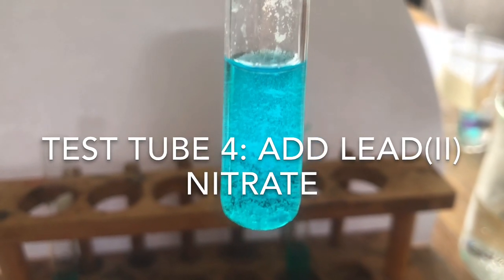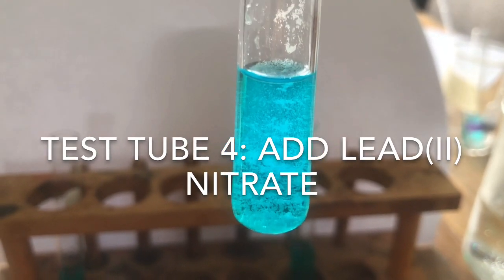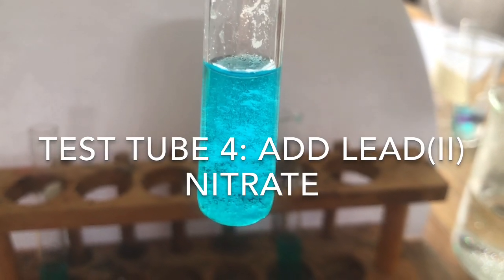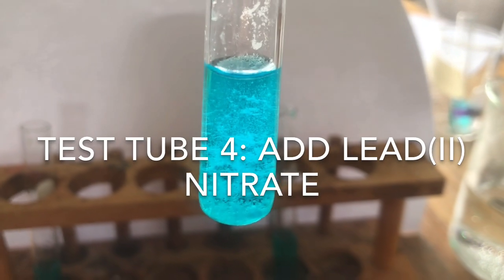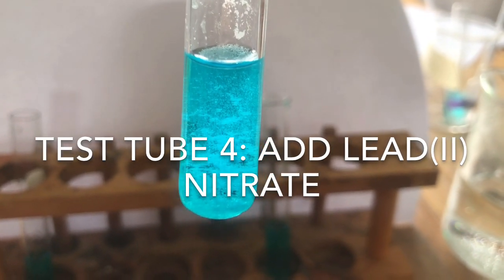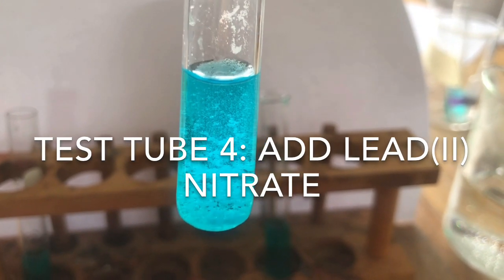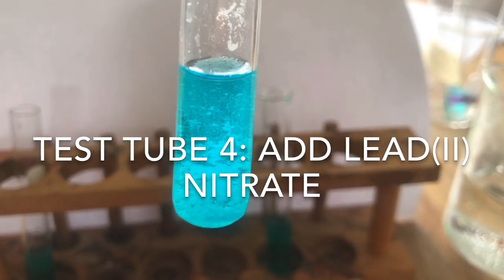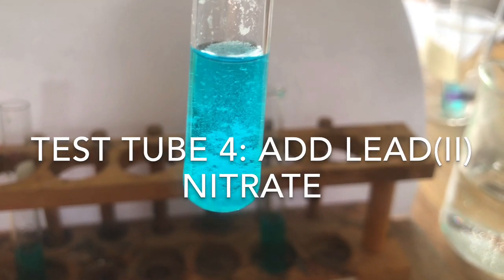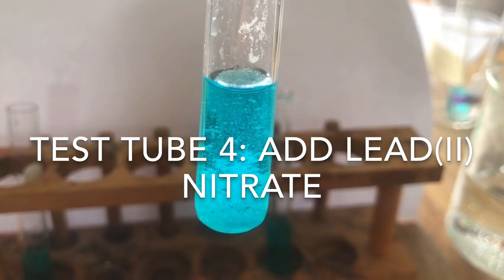You also notice that it turns more blue. What happens is when the lead reacts with the chloride, it has the same effect as removing chloride from solution. And when you remove the chloride, it's going to pull the reaction to the side of where that chloride is. So it's going to pull the reaction to the right and make the solution more blue.